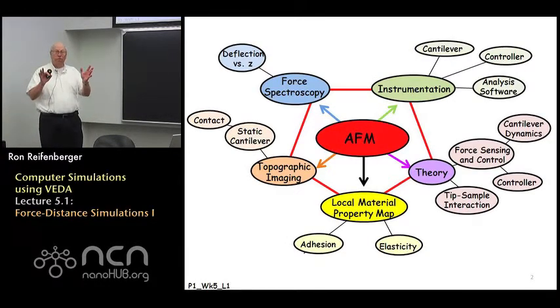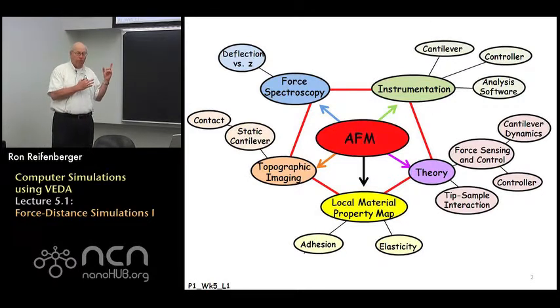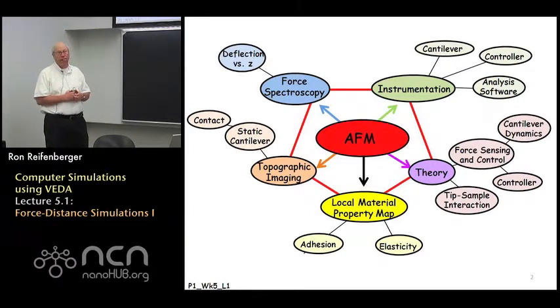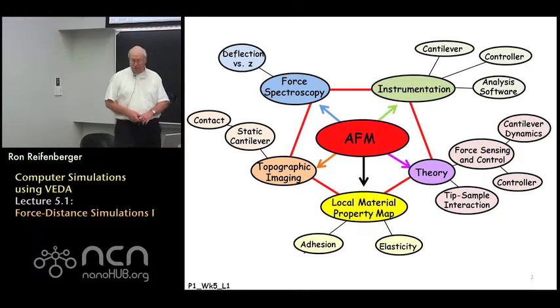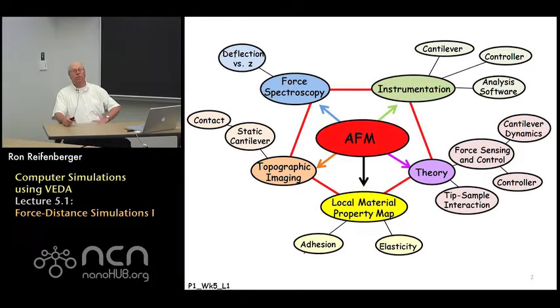By way of an overview for week 5, I'd like to pull up this bubble diagram and try to emphasize to you that we're going to cover a fair number of topics, but the topics are now going to be covered using the VEDA simulation. So rather than discuss the theory or the practice behind each of these subjects, we'll now simulate these quantities in VEDA. So let's get down and start to do a few of these simulations and walk you through them.